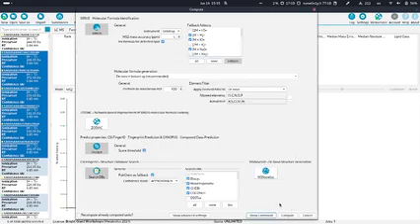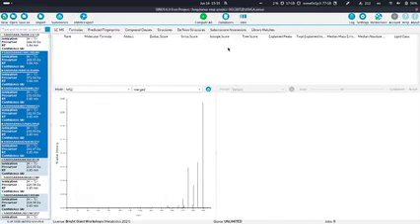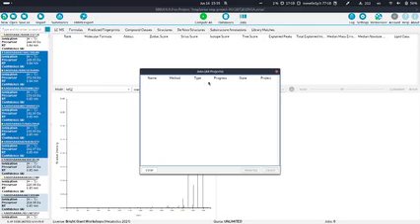Okay, now we are not going to click on compute now. You can try it out, but because we don't have infinite time, let's just cancel. But what you would normally do is click on compute and run all the computations. And if you run the computations, in the jobs pop-up you would see the progress of all your computations.